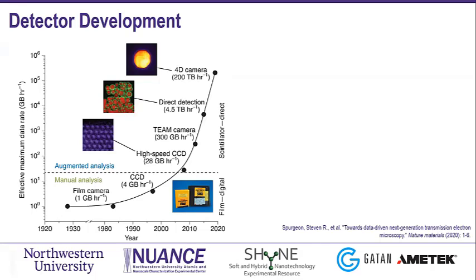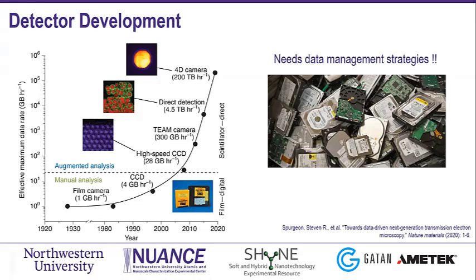So as you can imagine, it is still a scientific problem, but it becomes a data problem basically. You do need new data management strategies, and this is something to keep in mind when you are purchasing a new camera or trying to establish a technique such as 4D STEM here.